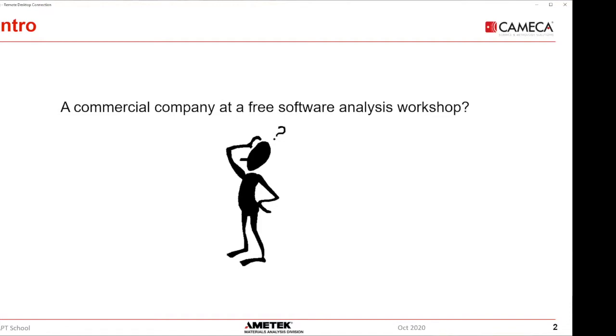Well, the thing is, we sell atom probes, and I would venture to say most of you are getting your atom probe data from a CAMECA atom probe. The software comes with it, so you probably have a copy of IVAS, and if you don't have APSuite, you probably soon will. My job here is to talk about our strategy with APSuite and what we're doing, and then I'll give you a demo at the end, showing you all the things that I find really interesting and that are new to APSuite.